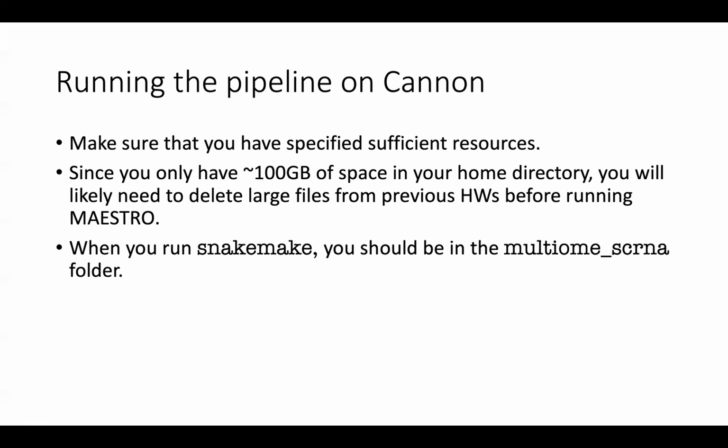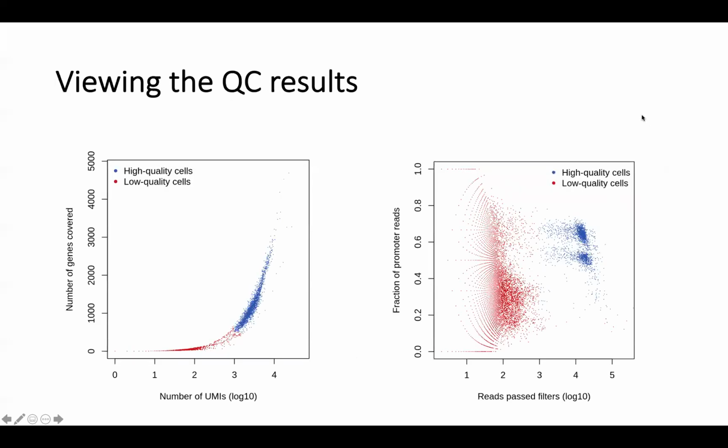All right. Okay, and so once you've actually run this pipeline, the questions are pretty simple. I think they just ask you to copy a few text files and download a few images. One is the results of the quality control. And so, here's kind of what you're supposed to get. One of them's for single cell ATAC-seq, one of them's for single cell RNA-seq.